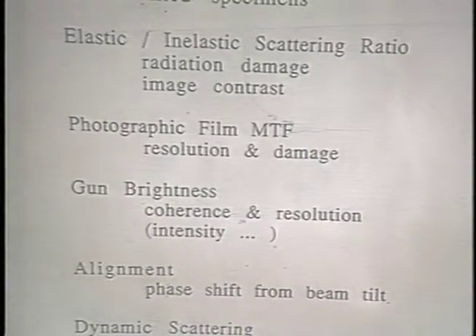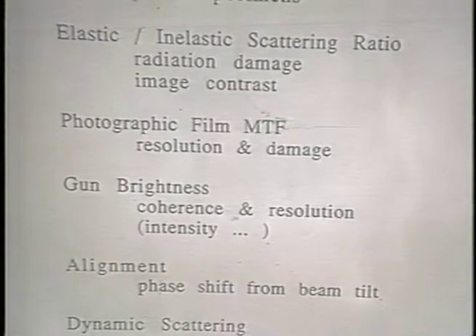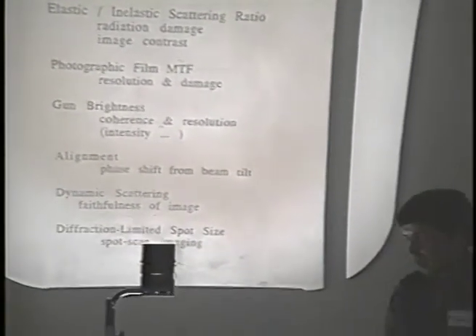So you're causing less damage to the specimen, but because the elastic scattering is lower, it ends up that you have to give the specimen more electron exposure to get a statistically well-defined image. So in order to compensate for the loss of contrast, you have to use a higher exposure. But the ratio of signal to damage does increase a little bit as you go to higher voltage.